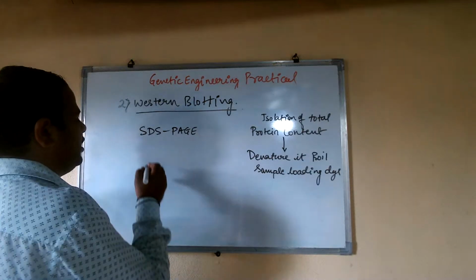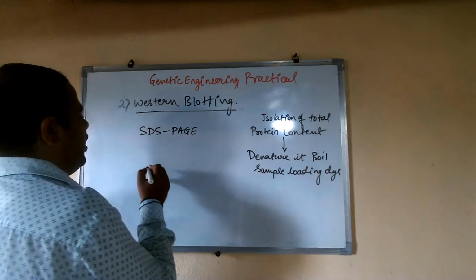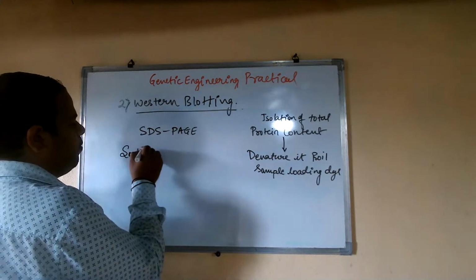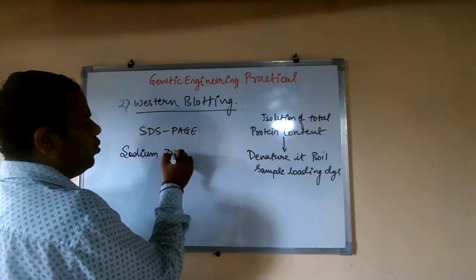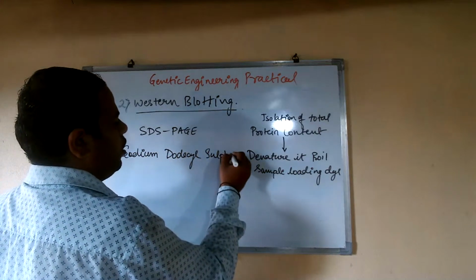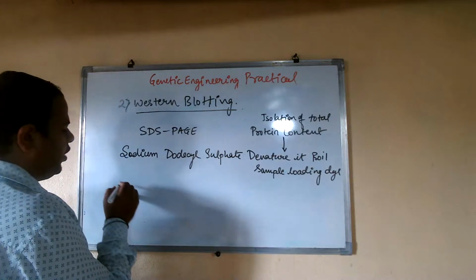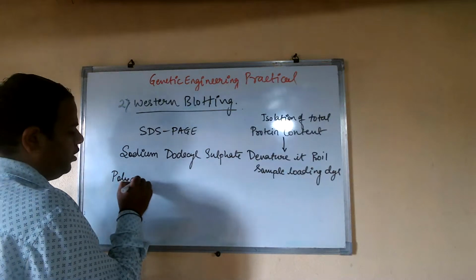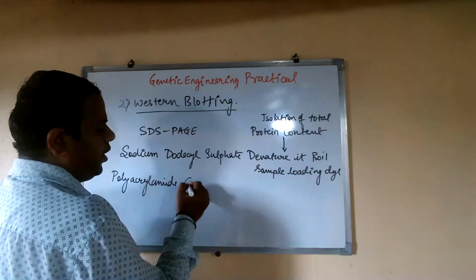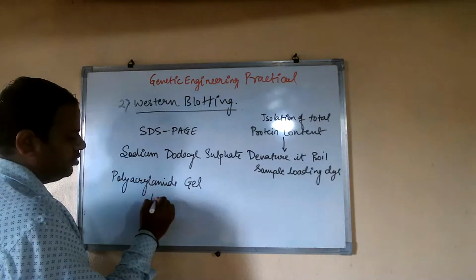So first of all, let's see what is SDS page. SDS page means sodium dodecyl sulfate polyacrylamide gel electrophoresis.